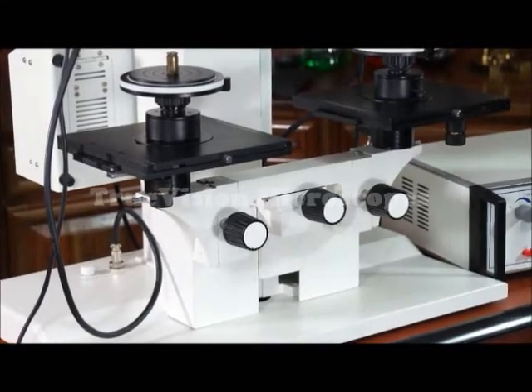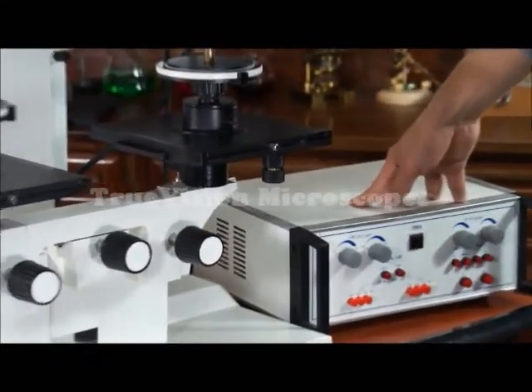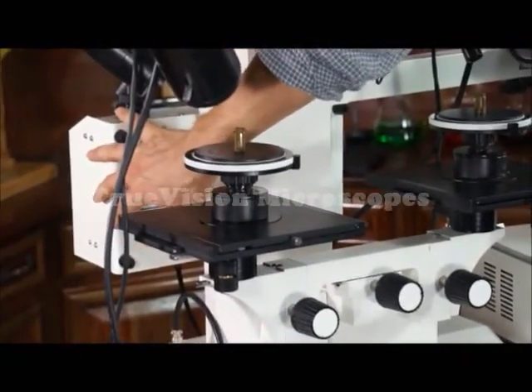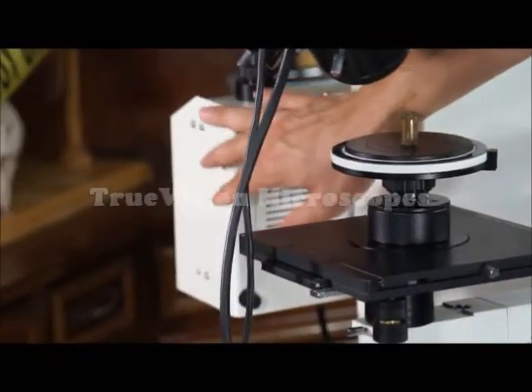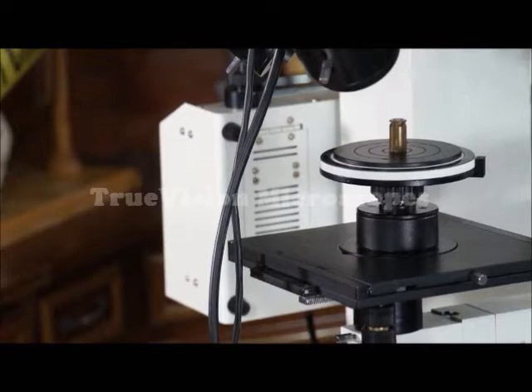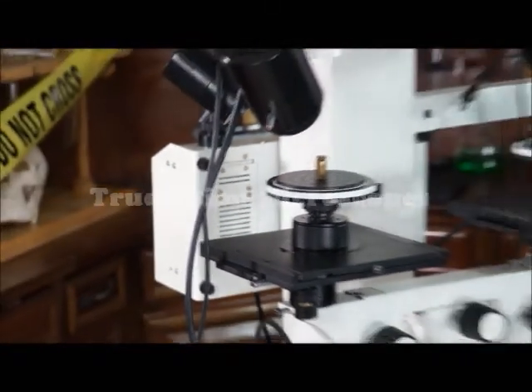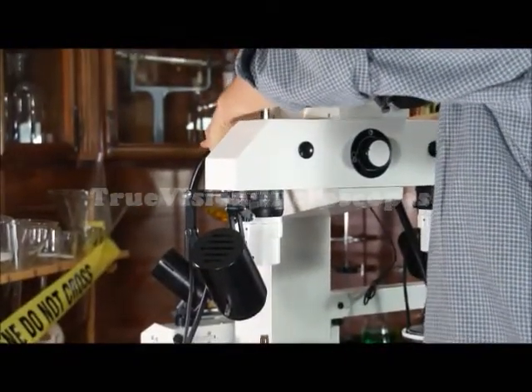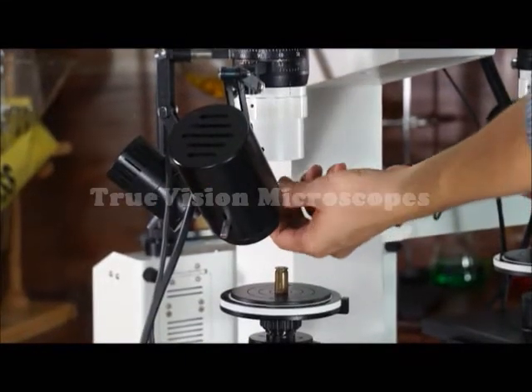We have the control panel on a control board, and we have a fiber optic illumination in the back. 150 watt fiber optic illumination per side, so it's 300 watts total fiber optic. These are fiber optic knobs, fiber optic pipes. They come down to a focusing tip.